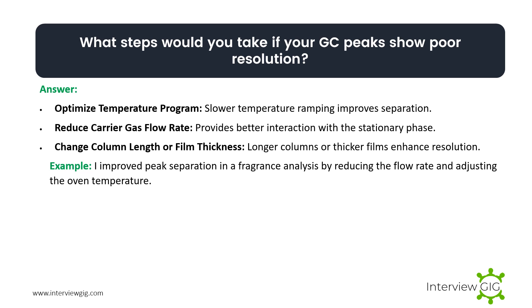What steps would you take if your GC peaks show poor resolution? Optimize the temperature program — slower temperature ramping improves separation. Reduce carrier gas flow rate — this provides better interaction with the stationary phase. Change column length or film thickness — longer columns or thicker films enhance resolution. Example: I improved peak separation in fragrance analysis by reducing the flow rate and adjusting the oven temperature.